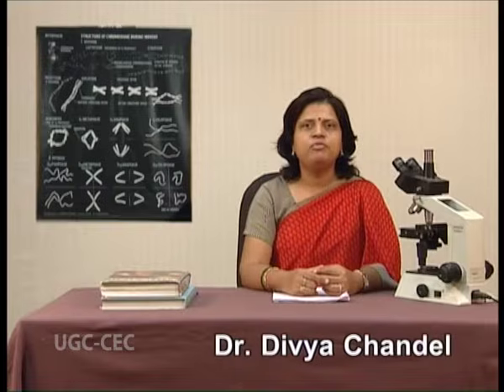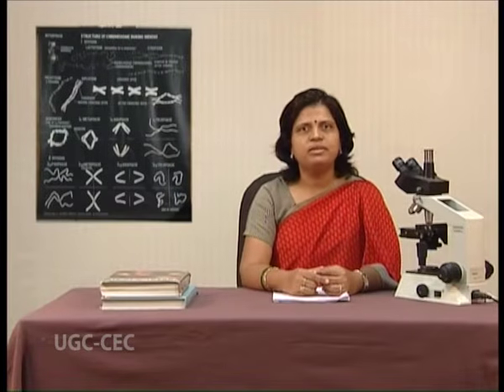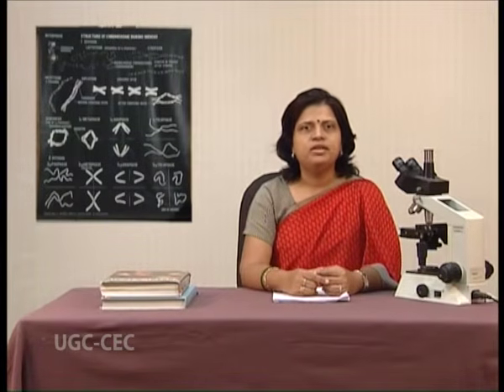Today we are going to perform a practical to observe the various stages of meiosis from rat or mice testes. Let us begin with a brief introduction which would be followed by the practical.